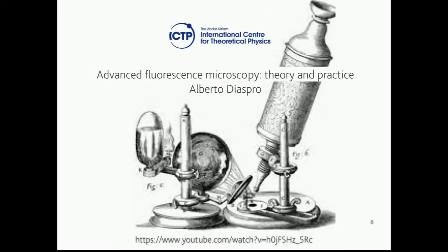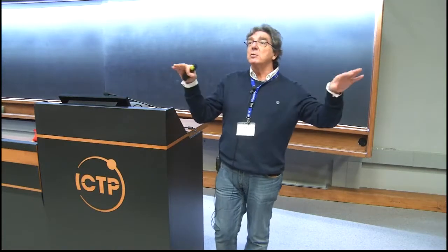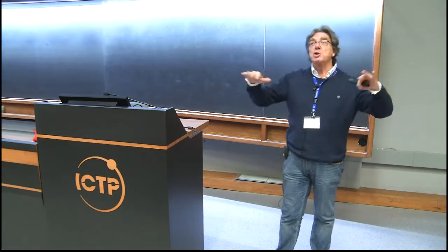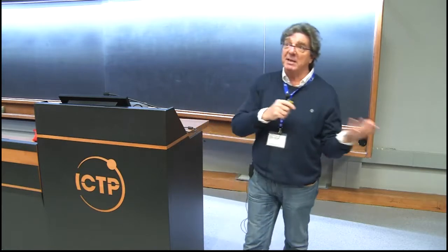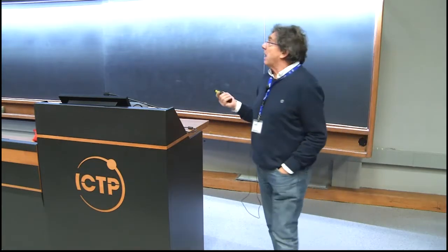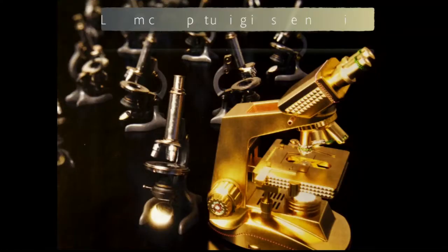So today, I will try to discuss with you about fluorescence. I don't know which is the background, but I know that the background is not homogeneous. So I will try to give some data about the basics of fluorescence and application and so on. So I'm sorry for those of you that are skilled in fluorescence.